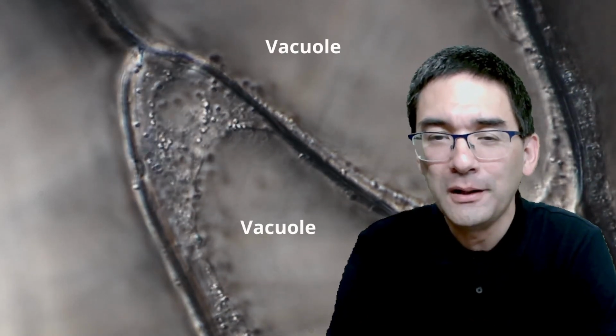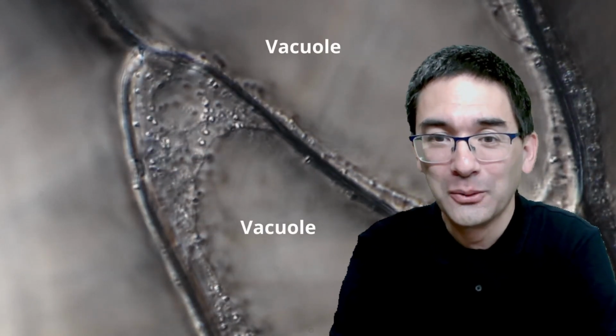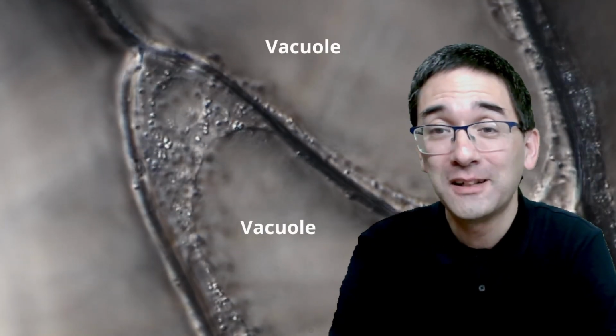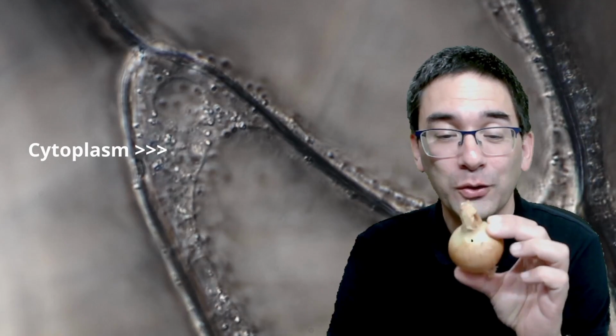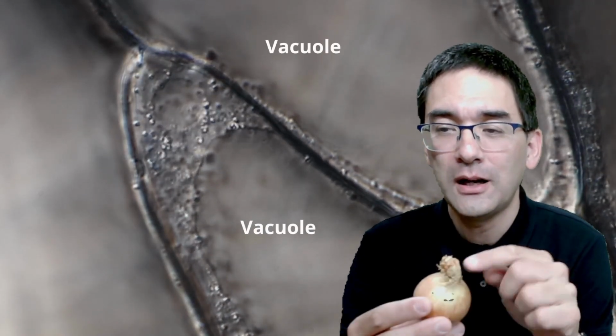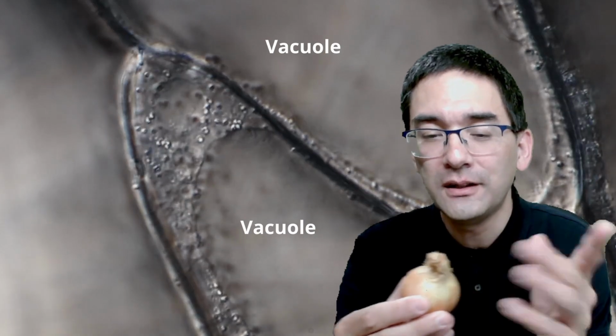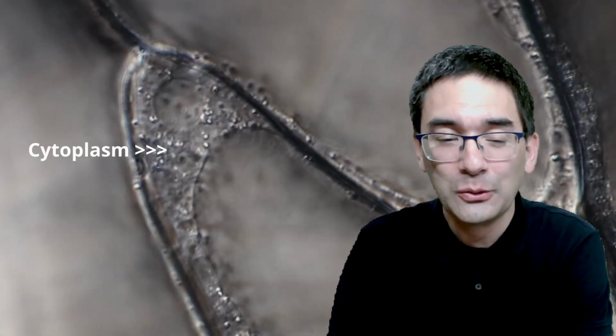The video is looping, but I just wanted to share it with you because it shows quite nicely the relationship between the cell wall, the cytoplasm and also the vacuole. I know I'm repeating myself, but it's important. I don't see any chloroplasts here because onion cells do not do photosynthesis. They're not green. If you put them into water a little bit, leaves come out, and then they will become green and contain chloroplasts too.